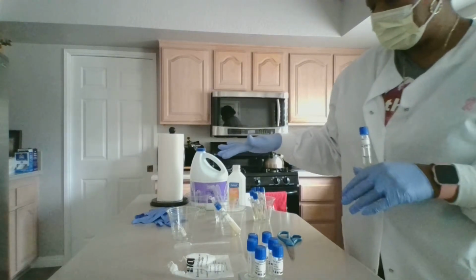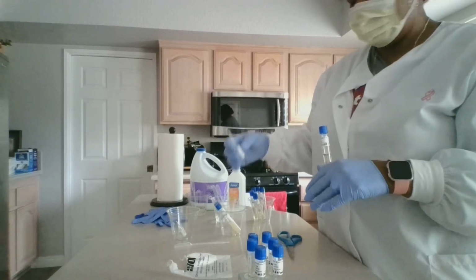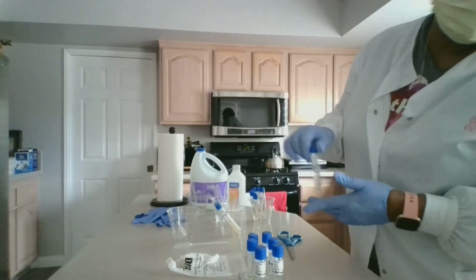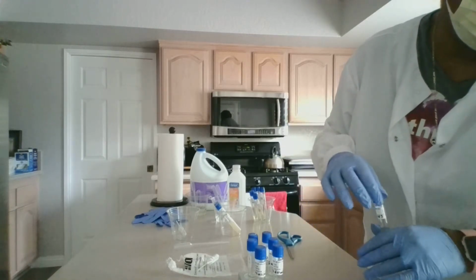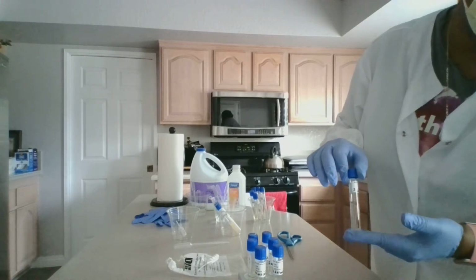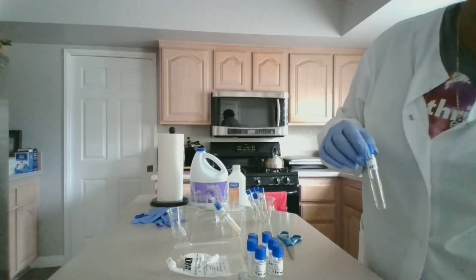And I'm going to wrap up the excess NaOH pipette and my HCl in a napkin, in a paper towel, and place it in the trash once I'm done. I'm going to do each step for each test according to my description, and add exactly 1 drop of the NaOH into the pH 9s as well. I'm going to do this for pH 5, 7, and 9.